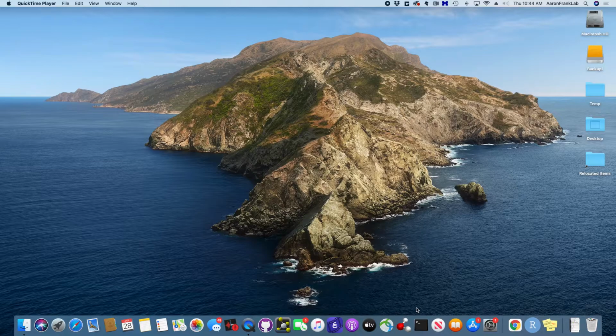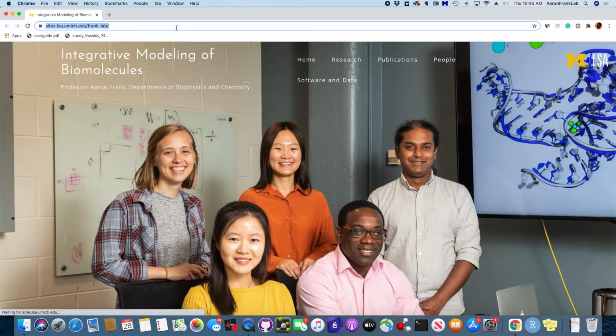And then that will give you a feel for, so if you work with a few of these, you'll get a feel for how to use commands in PyMOL. And pretty much at that point, the only limits would be your imagination. So what I'll do is just start by going to where I think is the place you can start when you want to learn more about PyMOL or do anything in PyMOL for the first time, right?